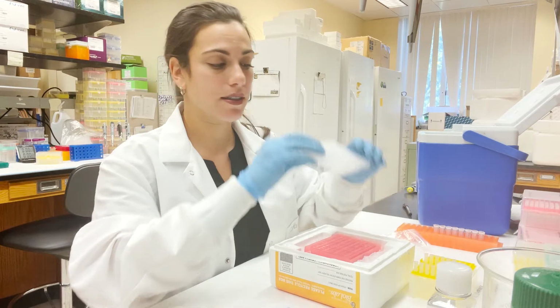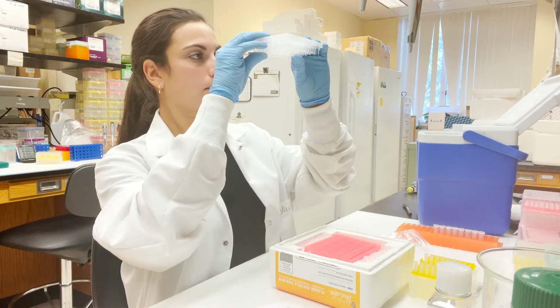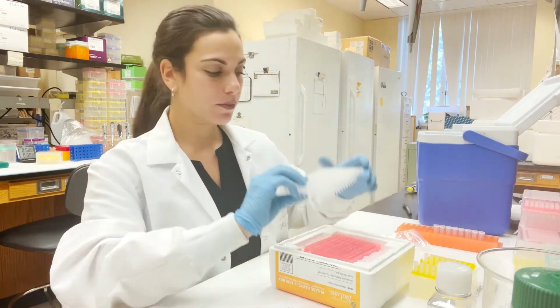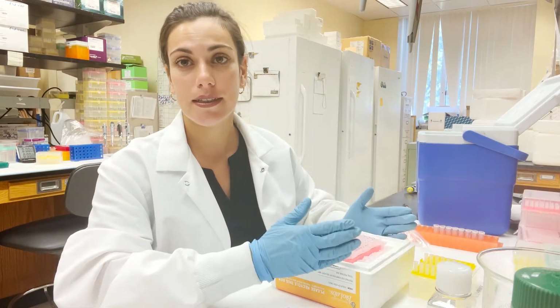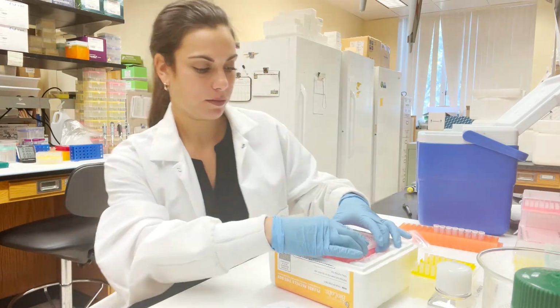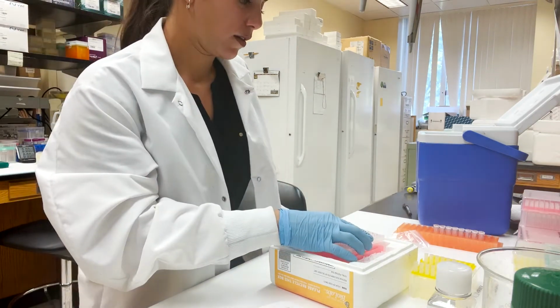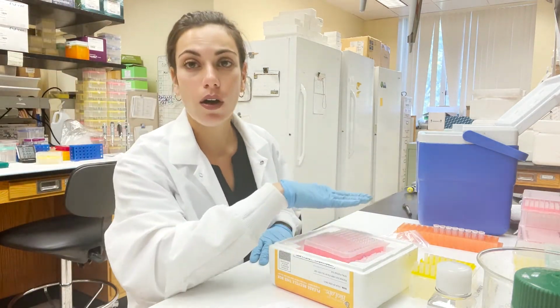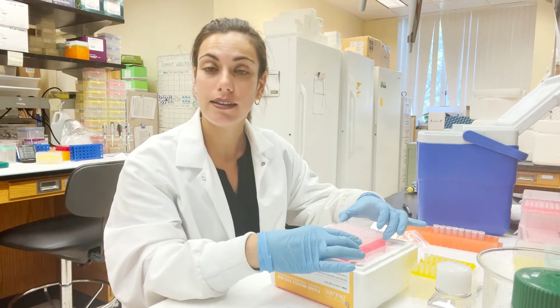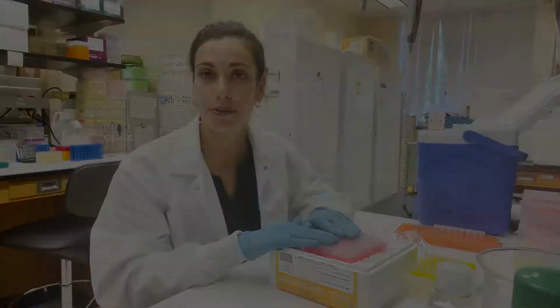So now I check my concentrations, make sure they're all the same. It is a little hard to tell because there are some bubbles in here. So fortunately in this lab we have a plate spinner, so I'm going to go spin those down. So now all of the levels are even. So we have done the dilution correctly. And now this plate can be stored in the freezer for future use.